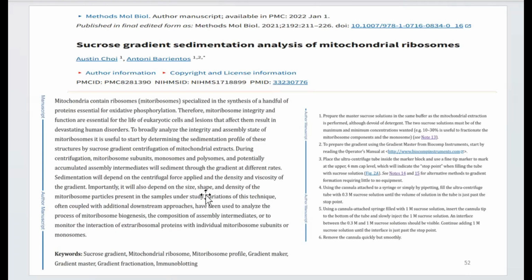So here not only separation, but you can find out the interactions also, if they are happening between extra-ribosomal proteins and mitoribosomes. This is the process given, with the manual details. It is just for extra reference that you can use it not only for separation, but for comparison of non-interacting and interacting components, which have different origin, different location, different function. So that is one part.